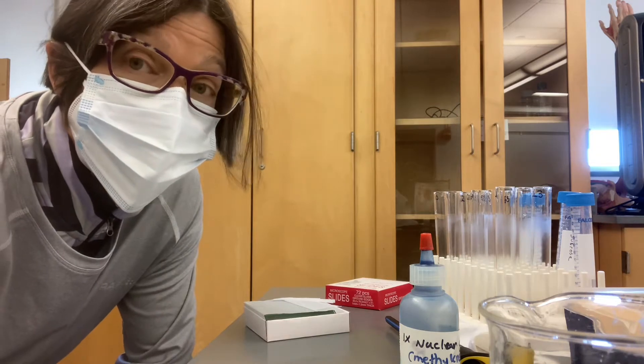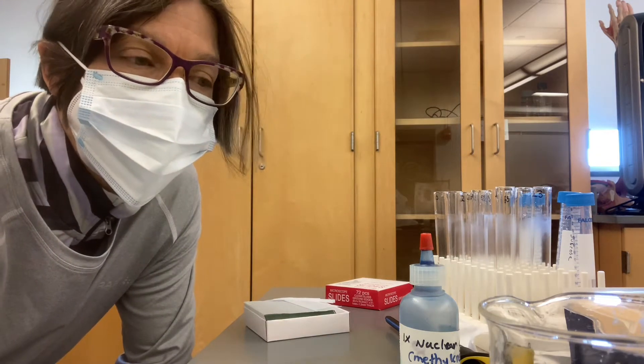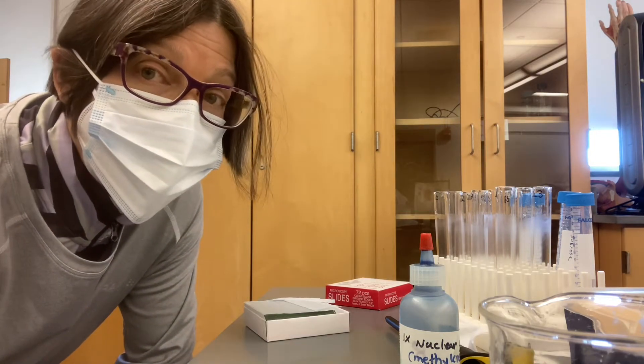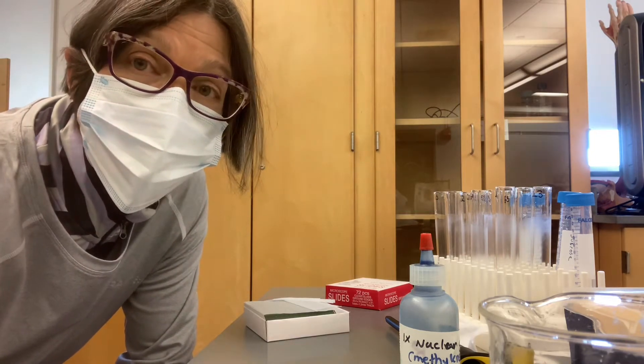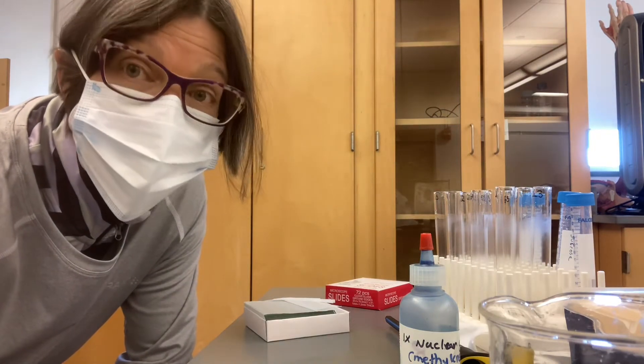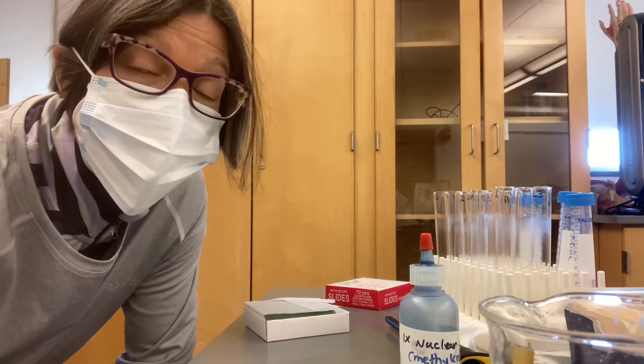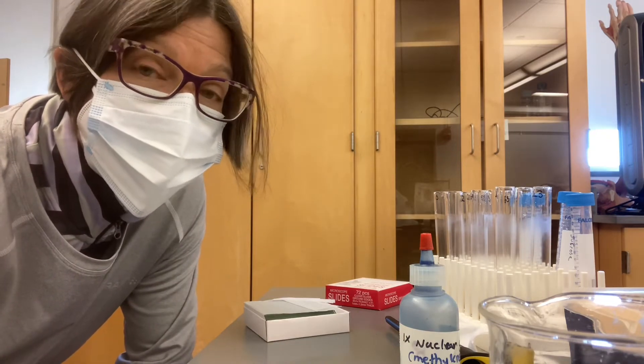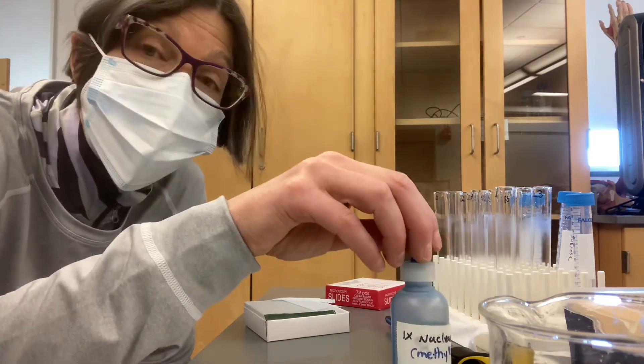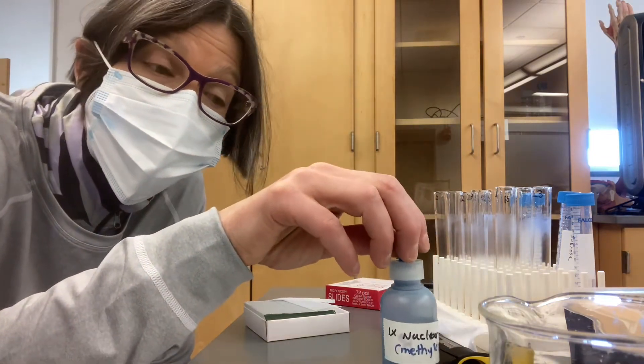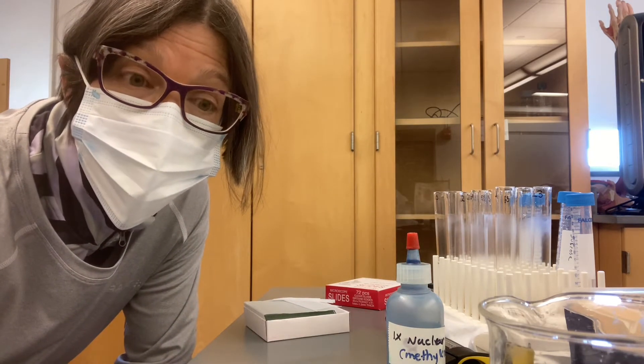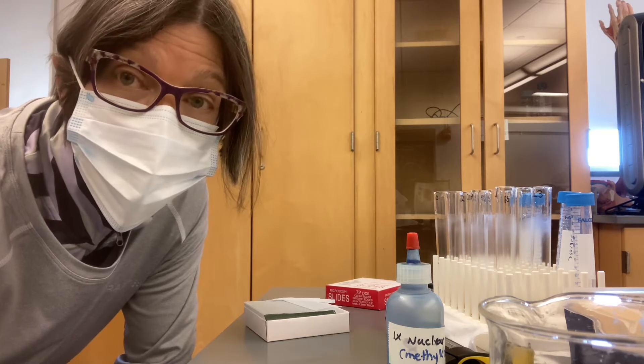And that turns out to be a really handy property because when you stain yeast cells with methylene blue, if the cells are alive, then they're actively doing metabolism. That means they're moving electrons around intracellularly. And if they're alive and they're doing metabolism, some of those electrons will end up being dumped onto methylene blue. And that will take the blue dye and it will convert it to the colorless form. And those cells will appear clear through the microscope when you examine them microscopically.